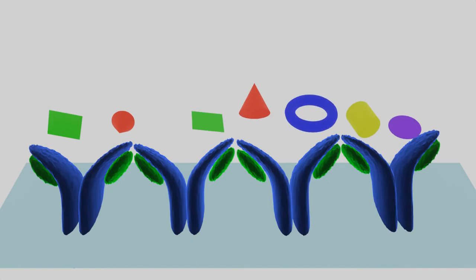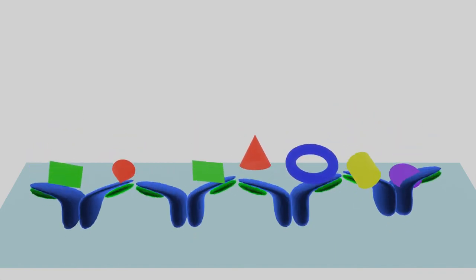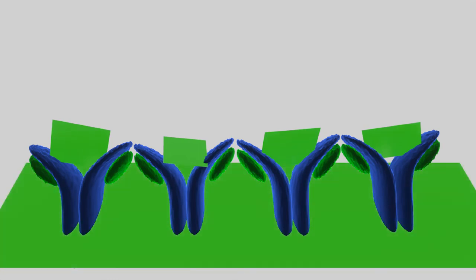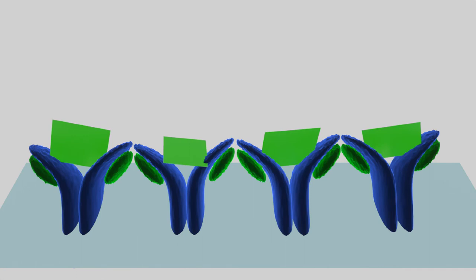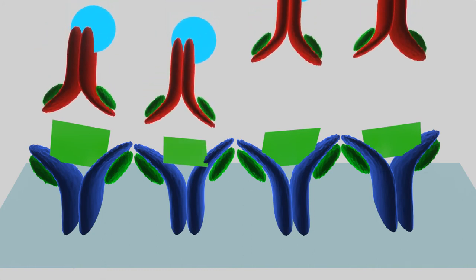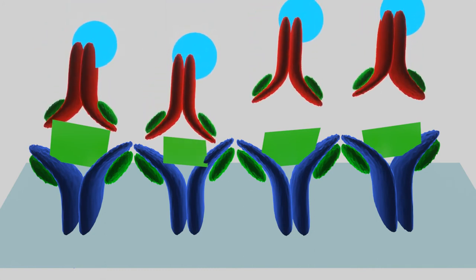Normally, it would have stuck directly to the surface. But here, the antibodies already cushion the surface and selectively capture HIV, not any other protein in your mix. Therefore, we have more effectively utilized the total surface area in this case, by binding only our antigen of interest. This increases the sensitivity, and makes this method preferable for samples where the antigen you are trying to detect is present in low concentrations.